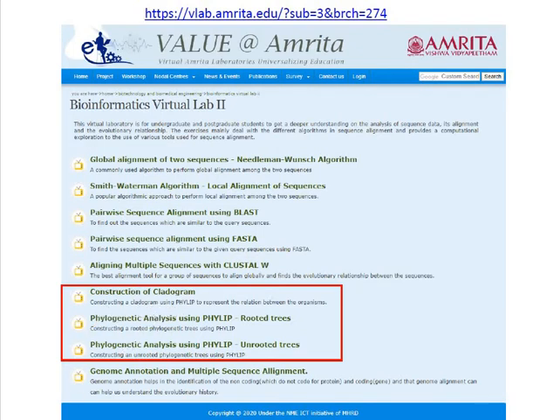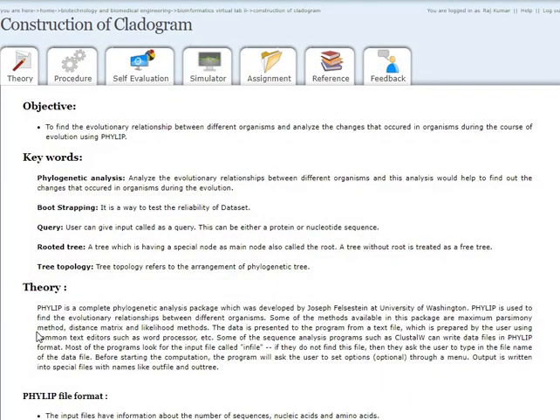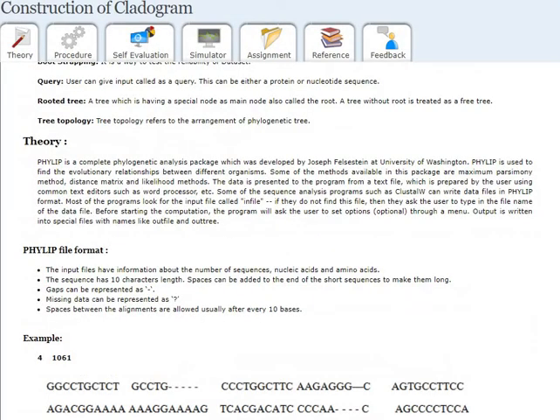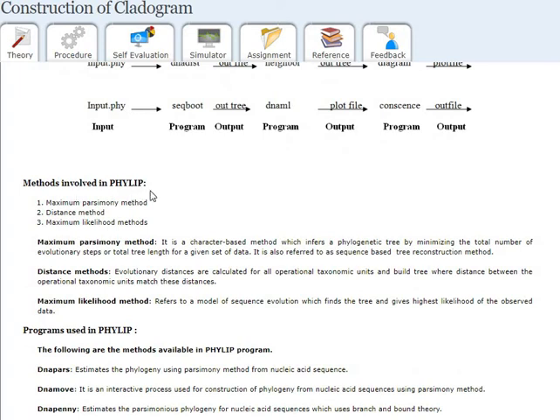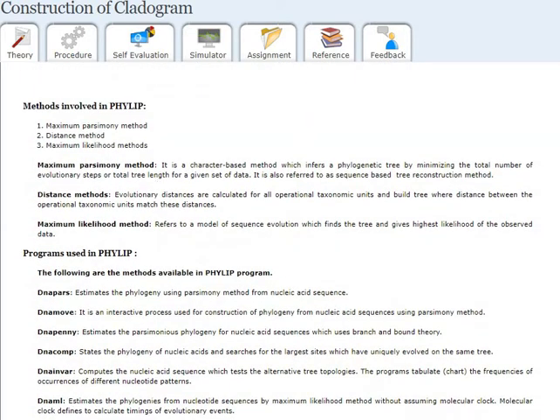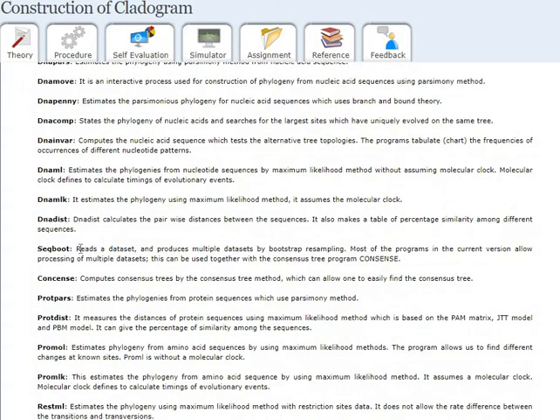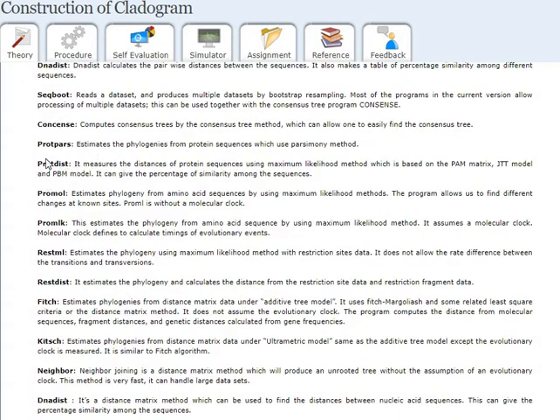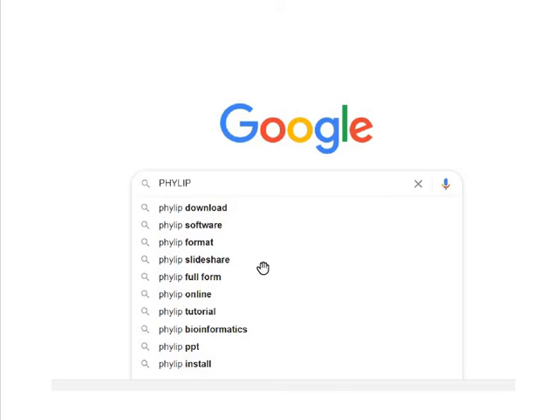If I follow the first one, 'Construction of Cladogram,' it leads us to this web page where you have some keywords and theory about the PHYLIP program, and importantly the methods involved in PHYLIP. There are several methods such as DNA ML, TNA, SeqBoot, ProML, and ProDist. We are going to use these different methods for phylogenetic analysis.